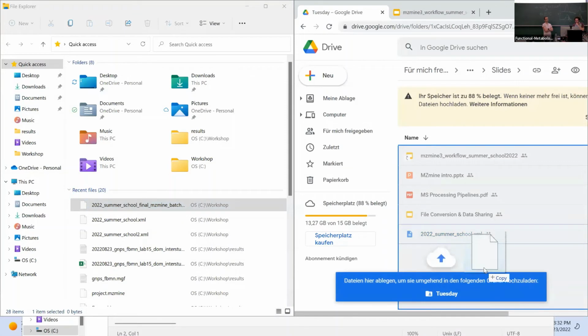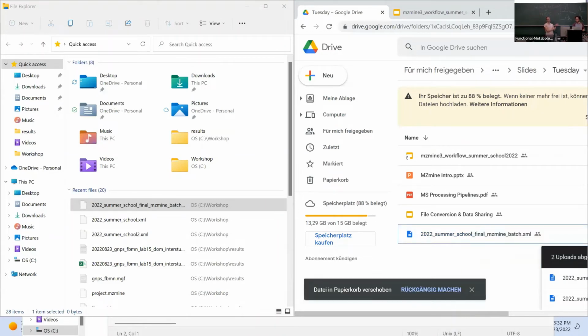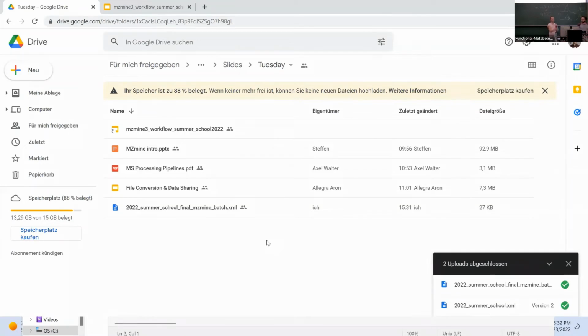And if you think that you maybe missed some explanation, since we're streaming everything and also recording, you can go back to the recordings after the summer school and go through it again. If you have any questions, you can also feel free to reach out to us. Since we already have the recording, it's a good resource for that. So for the remaining minutes, you can load the batch again and set the critical settings, and then you can all process it.